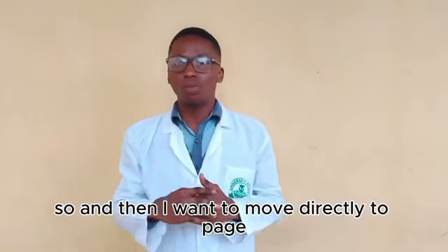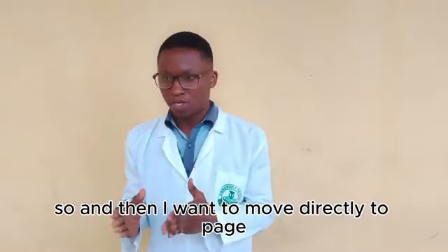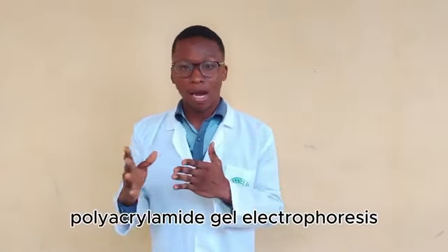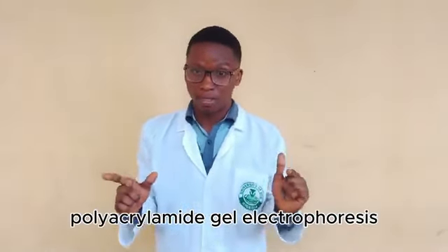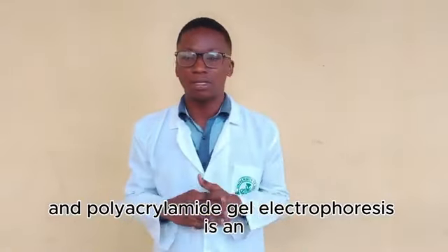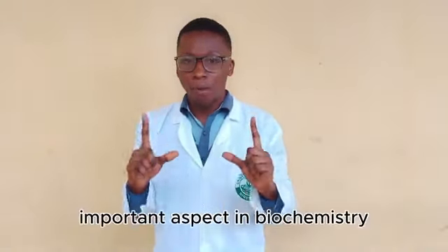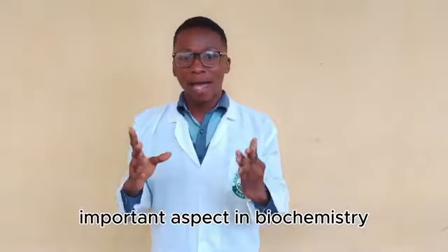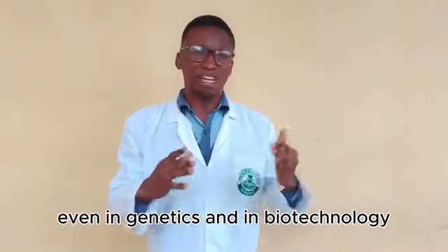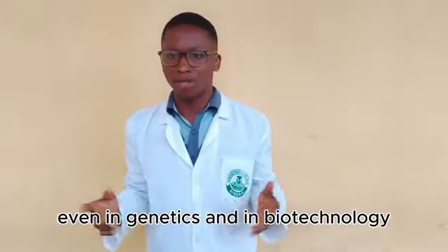And then I want to move directly to PAGE. As I said before, PAGE is an acronym for polyacrylamide gel electrophoresis, and it is an important aspect in biochemistry and in molecular biology, even in genetics and in biotechnology.